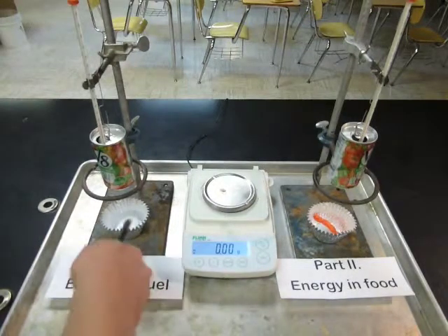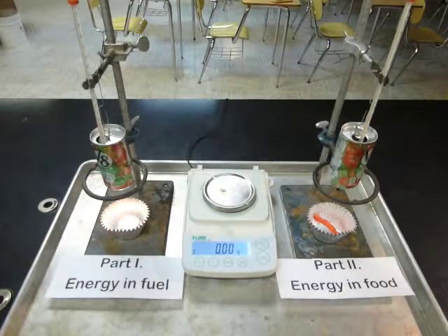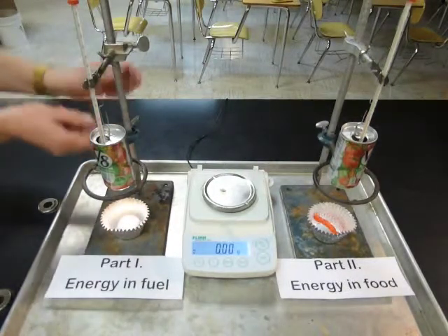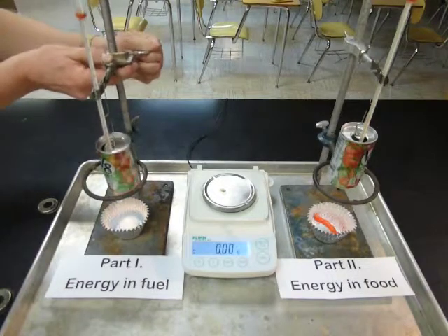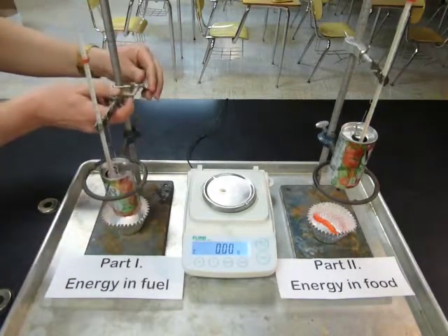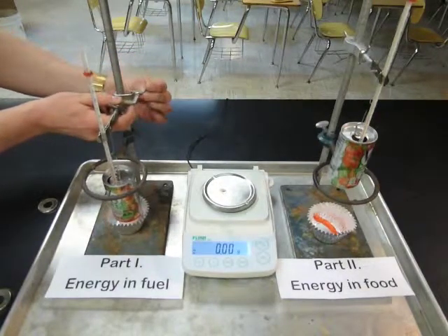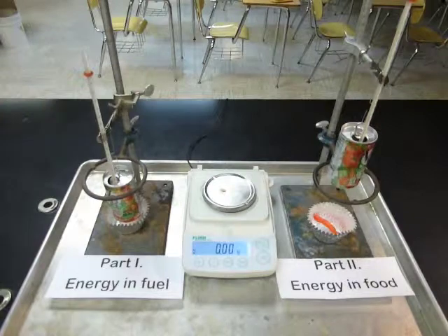Now when I light your fire, you're going to want to get your calorimeter down close to the candle so you can lower it down, and you want to get as much of the heat into the can as possible without putting out the flame. So that's the purpose of having the aluminum foil cup there. That's to help reflect the heat up into the can.